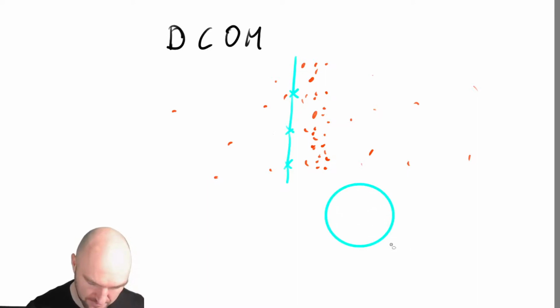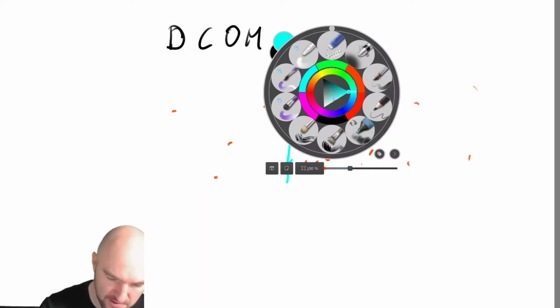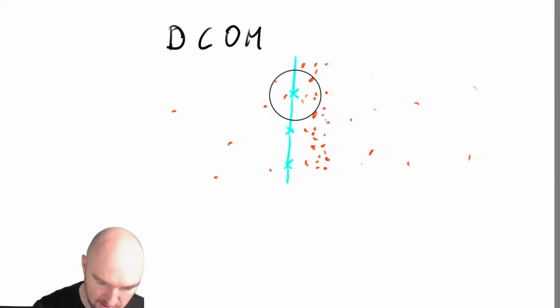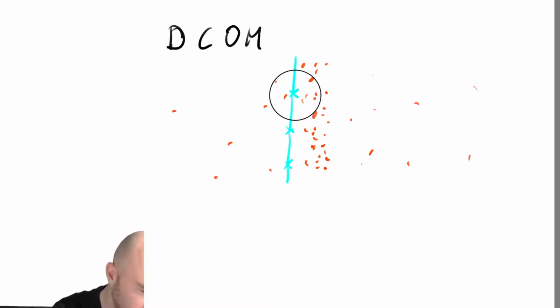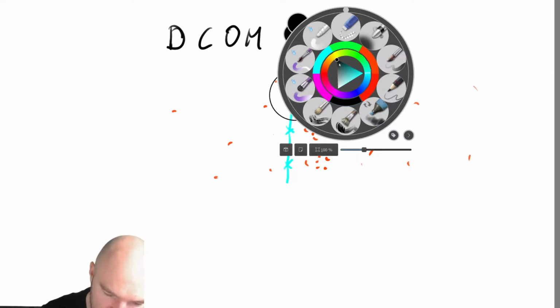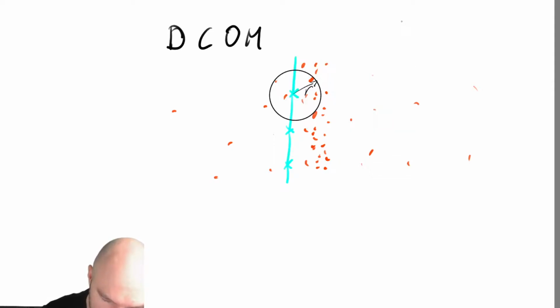Better. Okay. So I can just draw a circle of whatever size, of radius r around my vertex, and just look at the atomic positions. Look at the atomic positions of a certain type of atom. I can pick what type of atom that is.